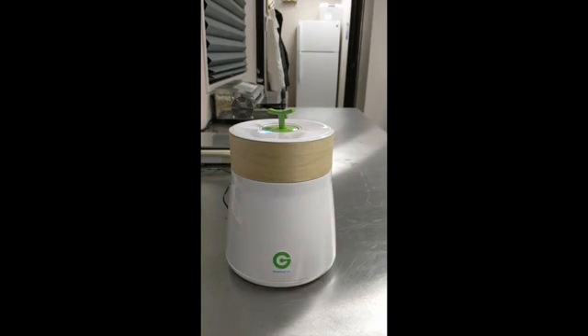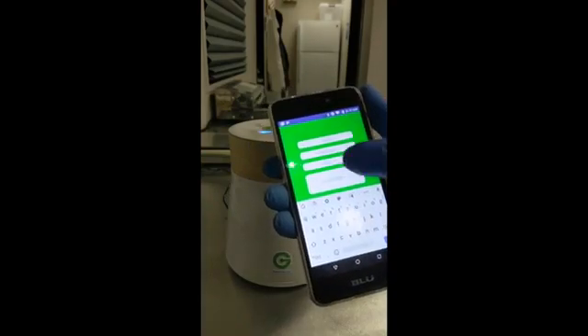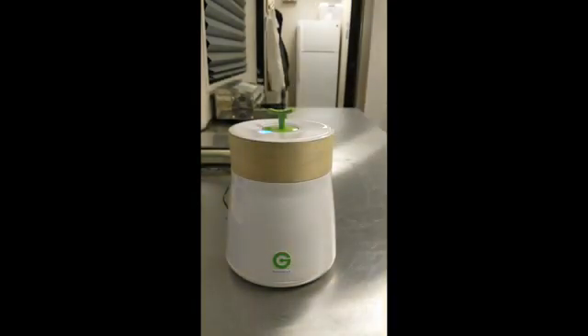It requires an app hooked to a phone or a tablet, and the first step is to put in the variety, the strain name. You can also put in other variables, but none of that is required.